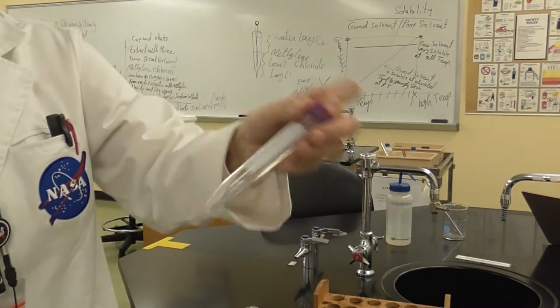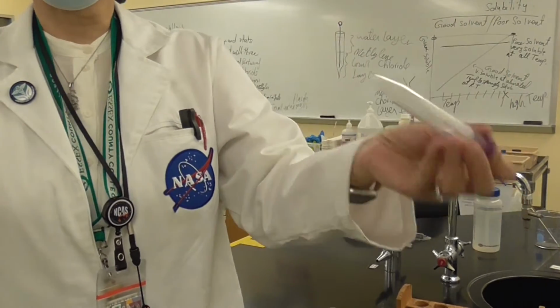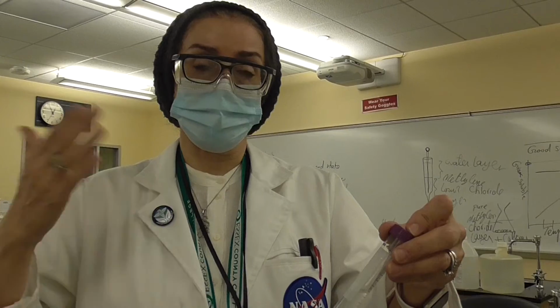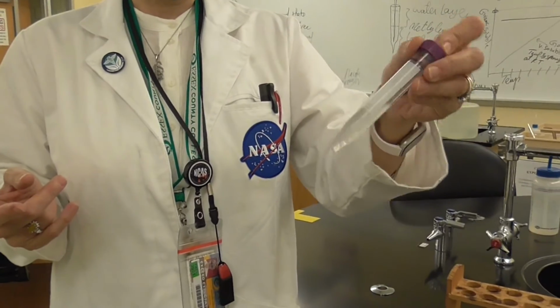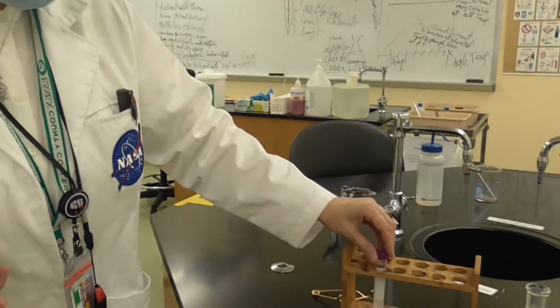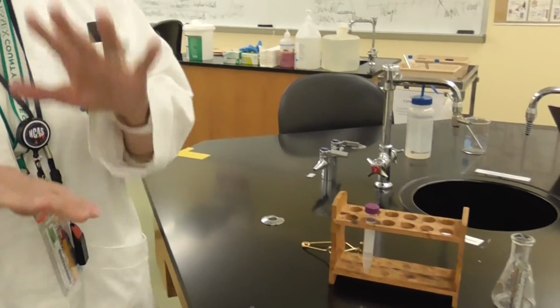We're going to shake it, making sure that we are able to extract as much as possible of the caffeine from the water layer into the organic layer. So I'm going to shake it, and then I'm going to let it stay still for another couple of minutes until you see the 2 layers clearly separated.